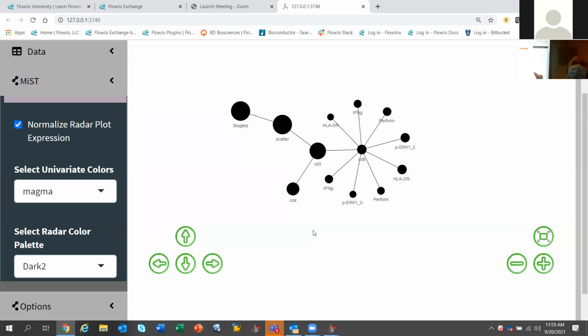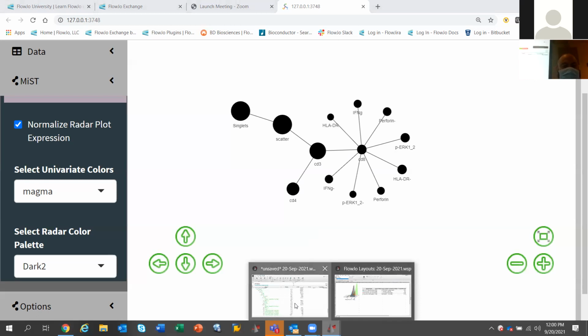This is super simple, so you don't need to be a flow cytometrist to understand what you did. And this is your figure 1 or 1A of your paper when you're talking in terms of your gating strategy. Or if you're presenting it in the lab, right? Even if your colleagues or lab mates are not very versed in flow cytometry, they'll get this. So, and I'll show you just one other trick since we have 1 minute left.